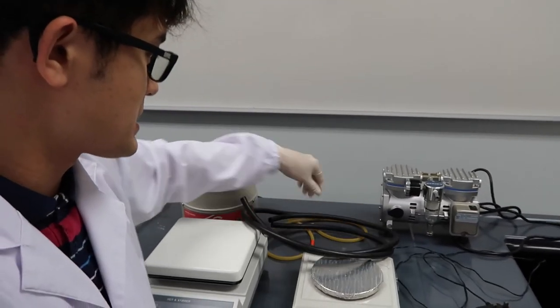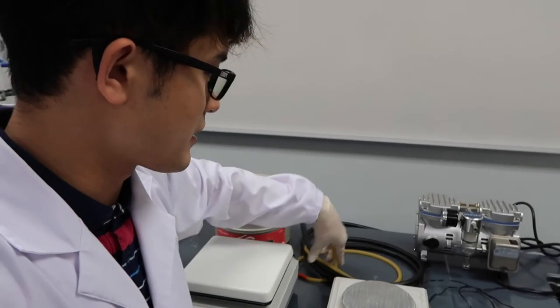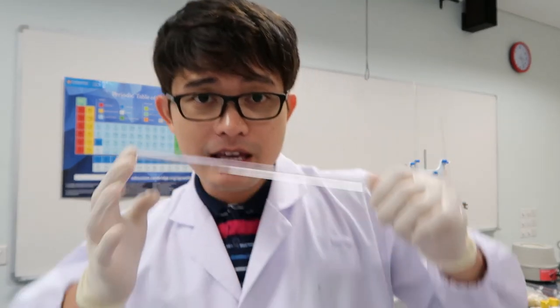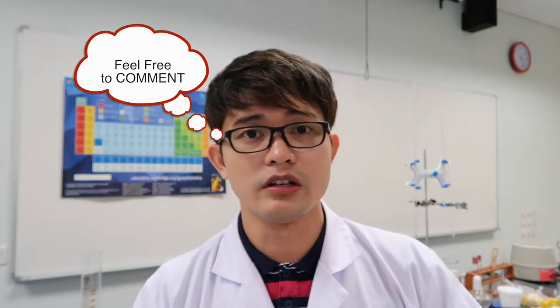We also have rubber tubings here — very useful in the lab. I hope you enjoyed this video! If I missed something, please feel free to comment and let me know.